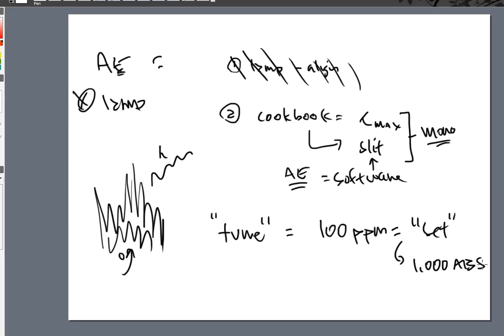We don't like to be in those upper realms if we can do away with it. So the AE and the AA system, for us at least with Agilent, will take your high standard in the emission world, and it will adjust the detector setting for it to read that high standard as a 1 absorbance, and that's what we're doing here.